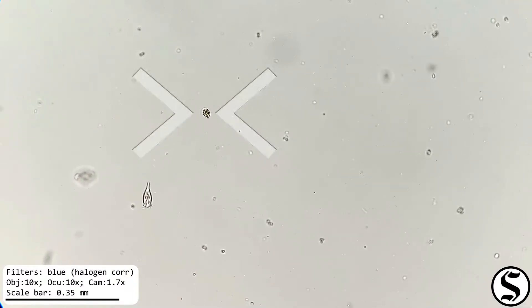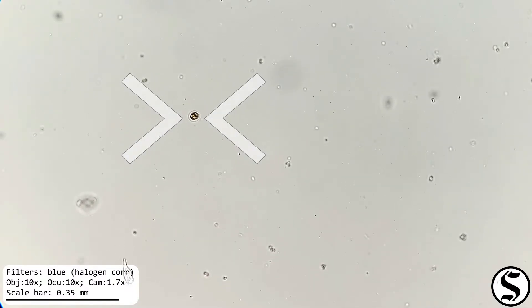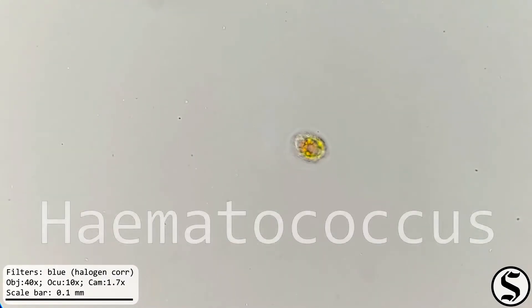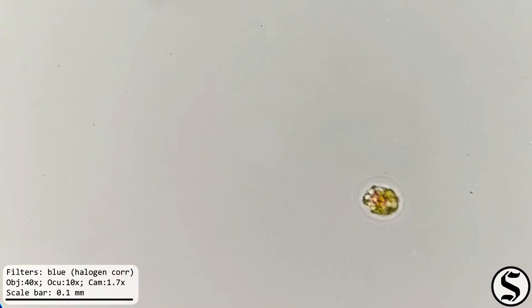As I was following this one swimming around, I noticed this other thing. And it turns out that this is actually a green algae, a chlorophyta of the genus Haematococcus. That comes from the Greek haema, blood, same as in hemoglobin, and often used to describe things that are reddish in color, and coccus, for grain or seed, to describe things that are spherical. And you can see it's actually got two flagella.